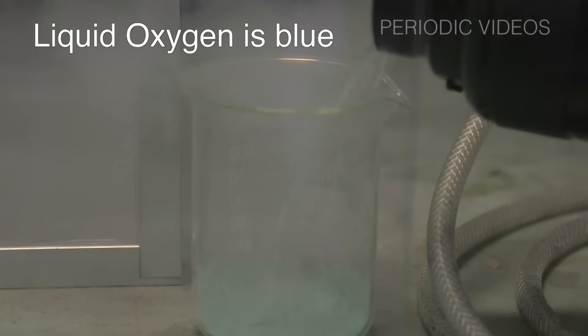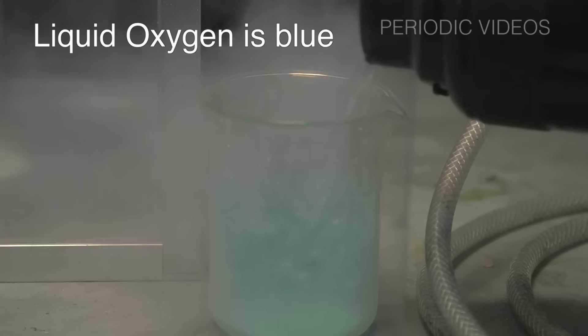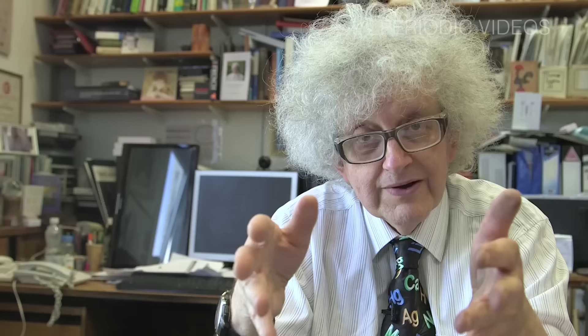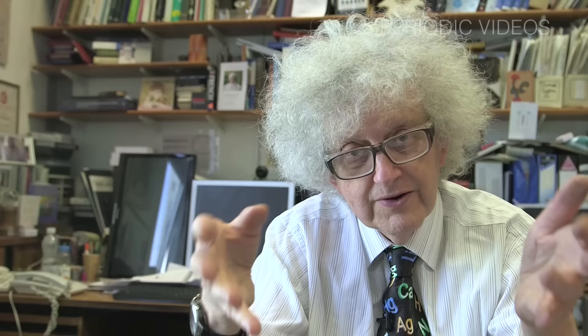But experimentally, this is not easy. The first problem is that liquid oxygen is very cold. So, the air contains water vapour, which can condense and ice the whole thing up very quickly. You could get round this by using a transparent dewar flask, thermos flask, but they're quite expensive. And the last thing you want to do is to put hot metal inside it and crack your favourite thermos vessel. And because these are evacuated, if they do crack, they will explode spectacularly. Which might make a good video, but is unfortunate if it's an expensive piece of kit.